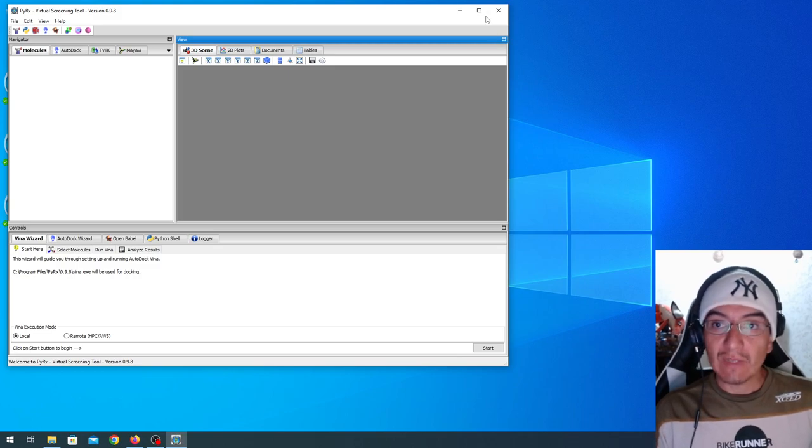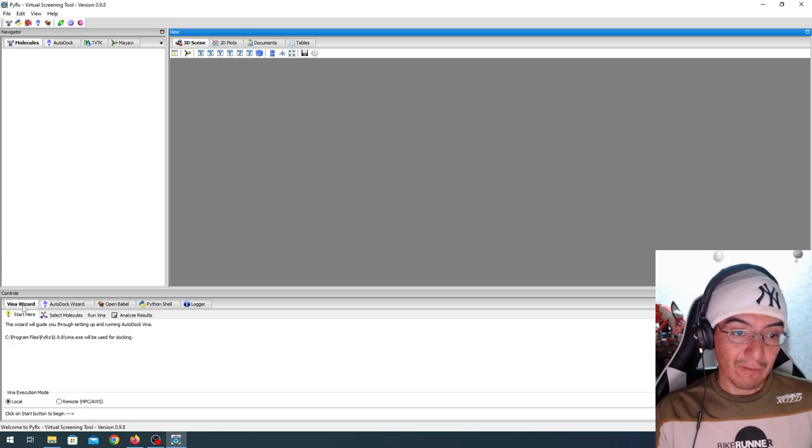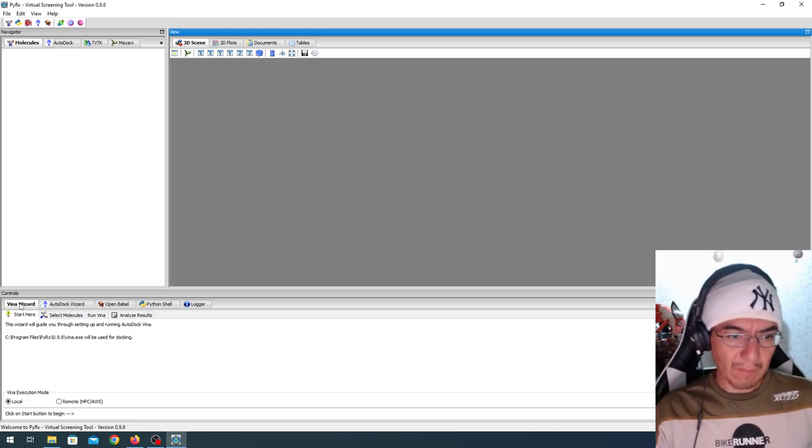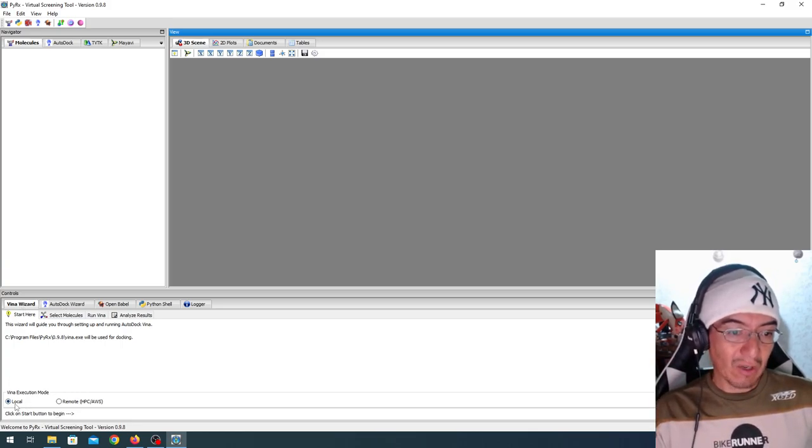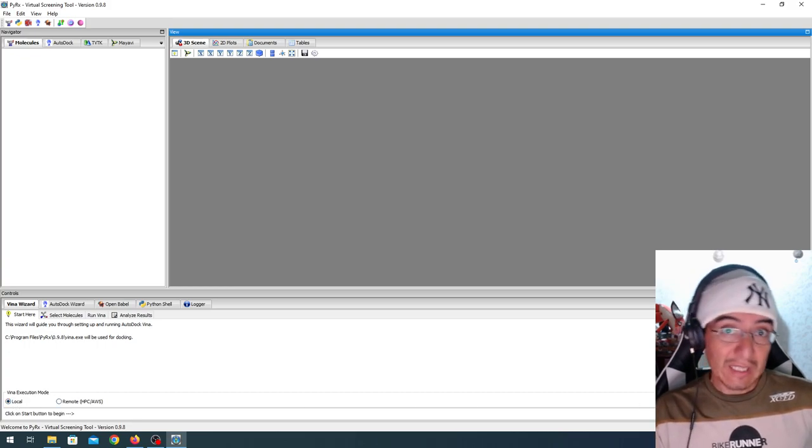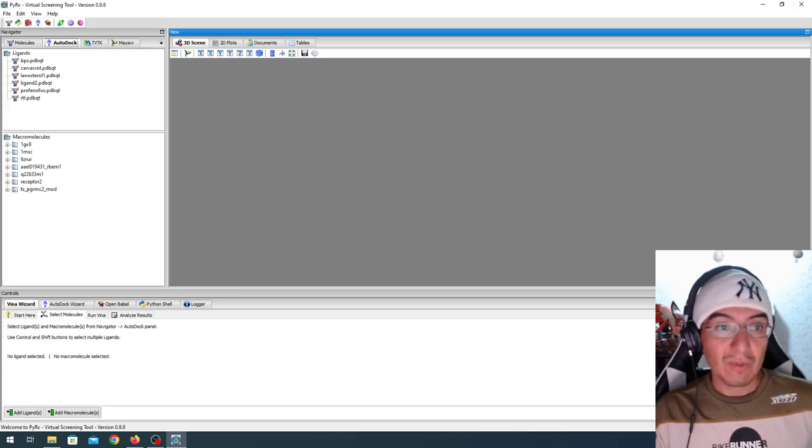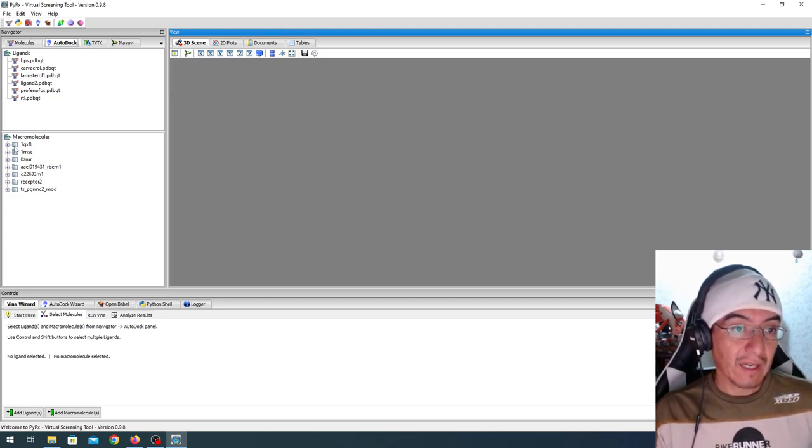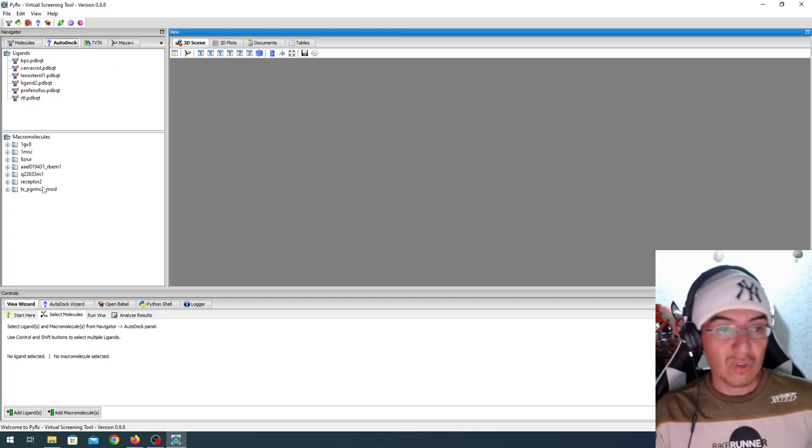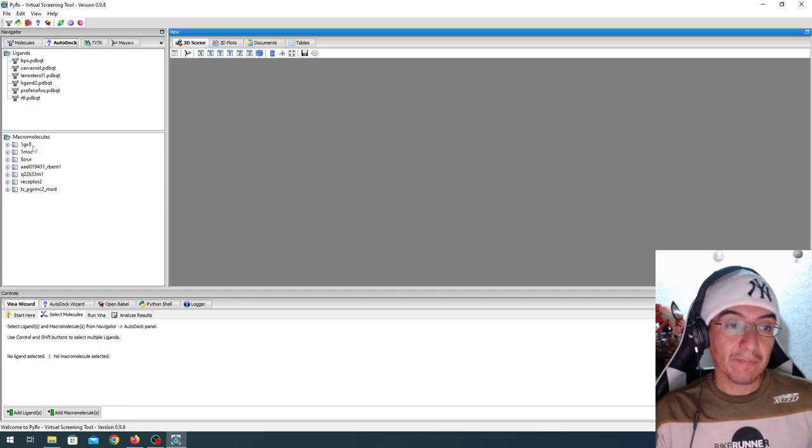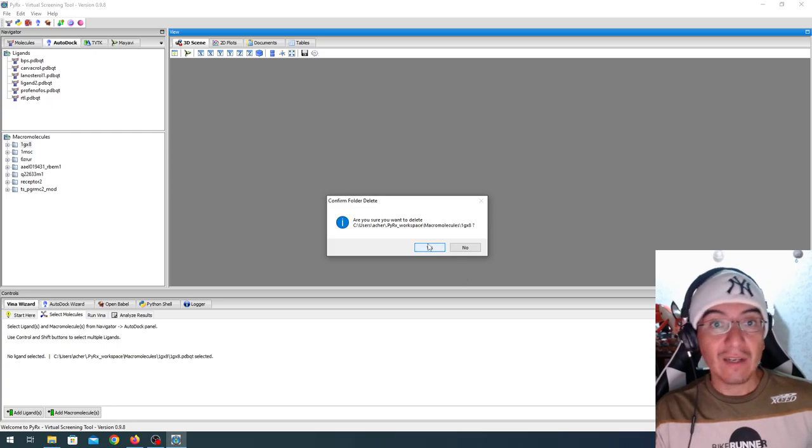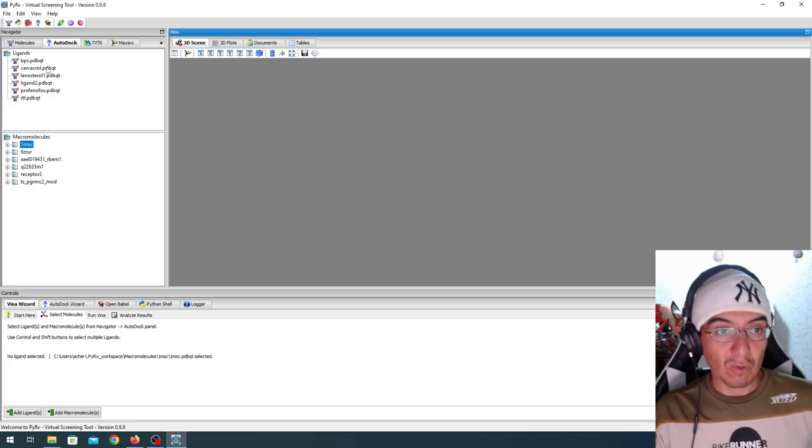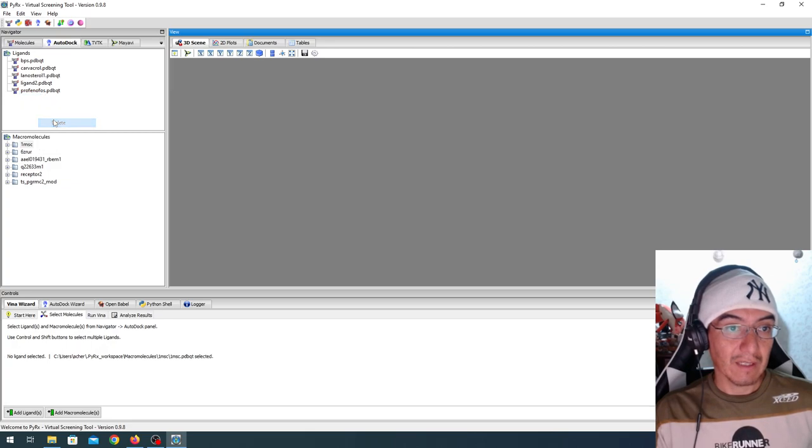Here we have the interface. By default, we have the Vina wizard, although there is an AutoDock. I'm just going to run the Vina one. And in local execution, as you can see, it tells us to go to the start button to begin. And here we have the list of ligands and macromolecules that have been used in this system. I'm going to select this one, but I'm going to delete it. I ran this docking previously, but I'm going to do it again. And the same for this ligand. Delete.